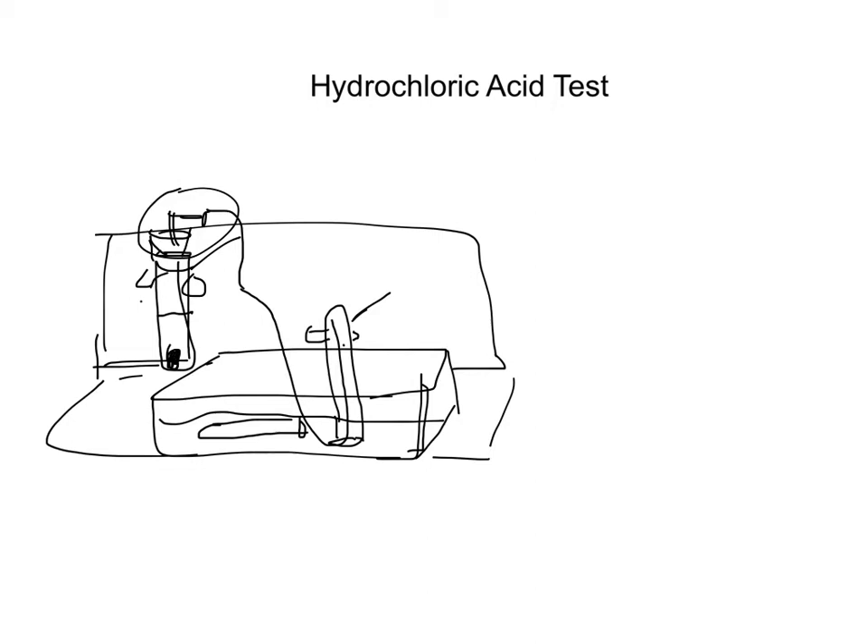It won't kill you instantly or anything like that, but it is uncomfortable and unpleasant, so I like to do this in the hood. If you work quickly enough, as soon as you've got the hydrochloric acid on there, you're going to cap this. If a reaction is happening, not only will you see bubbling, but you can gently touch the bottom of that test tube with your fingers and feel that it will get hot, indicating a chemical reaction is happening. You're also going to be collecting the gas — if there is a reaction, you'll have hydrogen gas collecting in the small test tube. You might get more gas than it will hold, in which case you'll see bubbling in the water as it overflows.